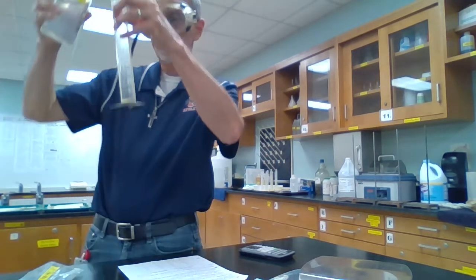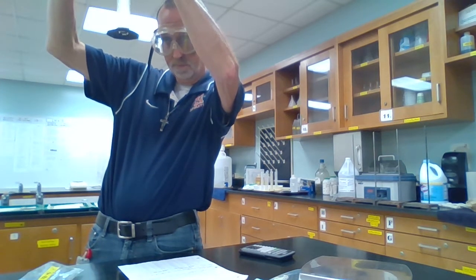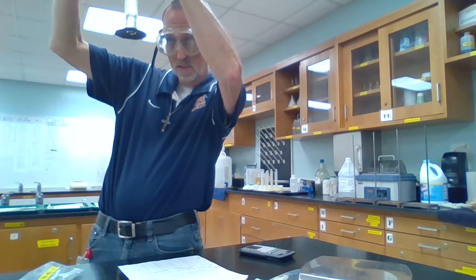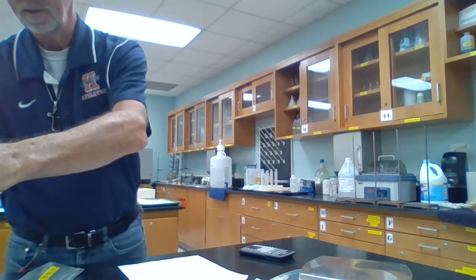Now we'll do set B. I'm going to go ahead and get my volume set up here again. Got the pennies drying. All right, I'm right at 20 again. So 20.0 will be my starting point, just like it was the first time.